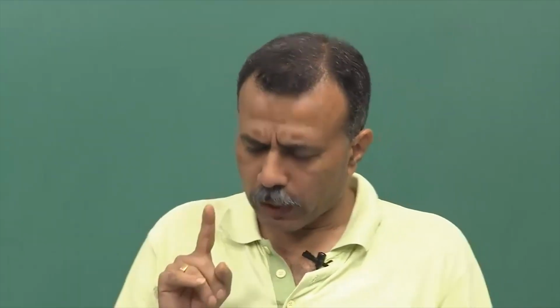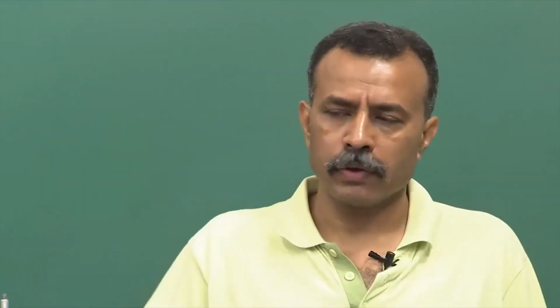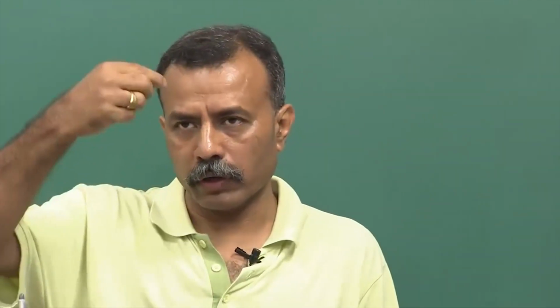So, in the last lecture we talked about the mechanical dissociation of the hippocampal tissue, and this whole mechanical dissociation process is uniform. I am just taking up one simple example, and one has to be slightly careful while you are doing mechanical dissociation, while you are offering a shear force to the piece of tissue to dissociate it into single cell suspension.